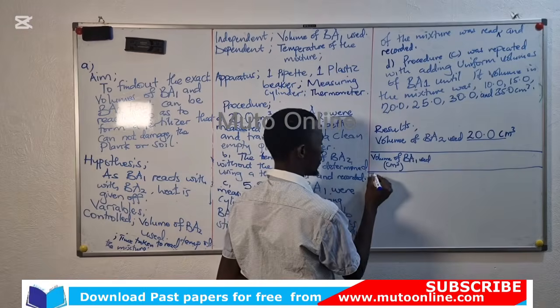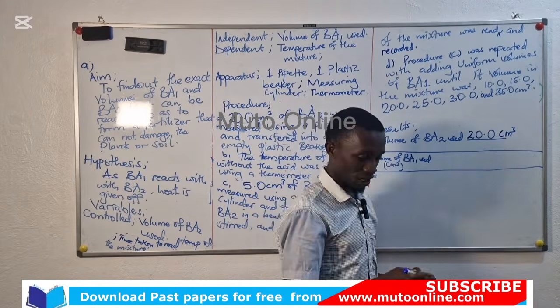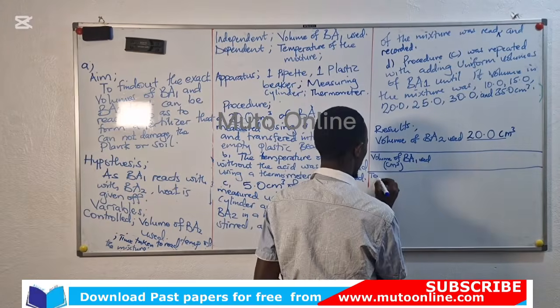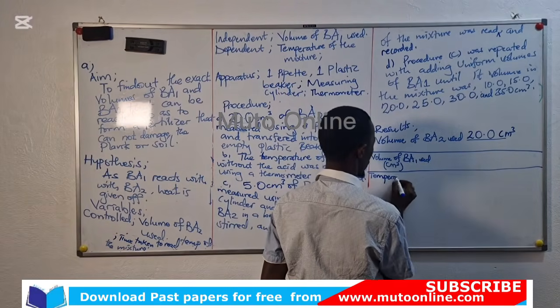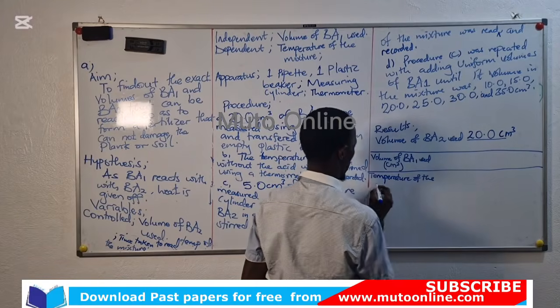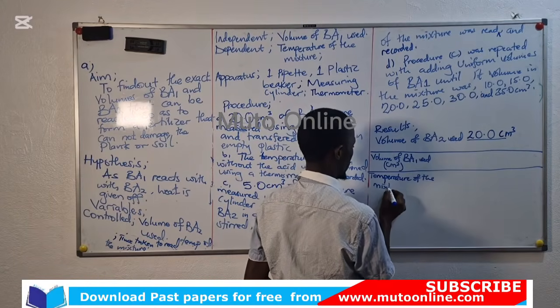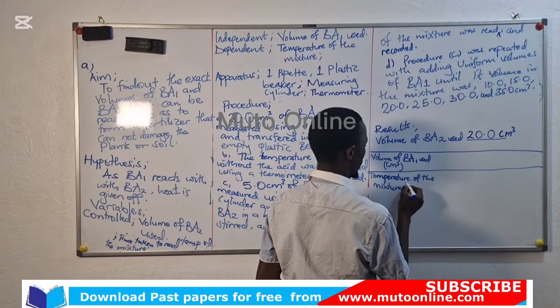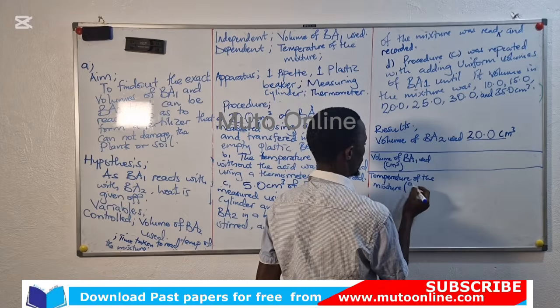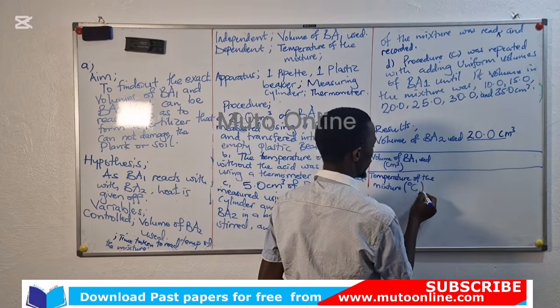And I will have the temperature of the mixture. And members, temperature is read from a thermometer that records its values in degrees Celsius.